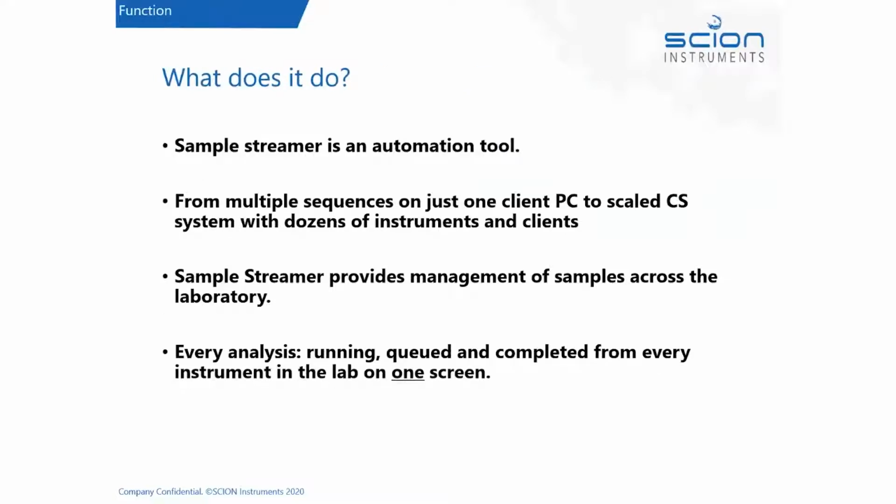As I mentioned, it's mostly an automation tool. It's designed to streamline throughput in the laboratory so that you can get an overview of all of the samples that are running, to be run, have completed on one single screen. So you can have multiple sequences running on multiple instruments, and all of that will be available for review, for reordering, for reshuffling, for better throughput on your overall laboratory.